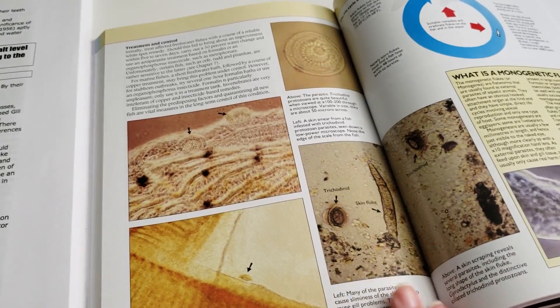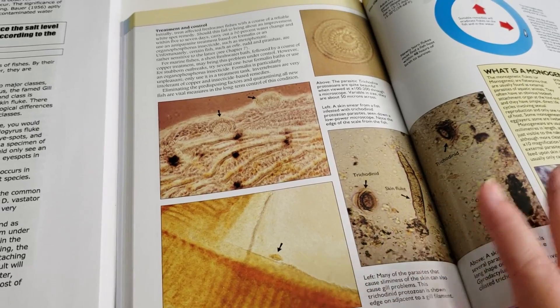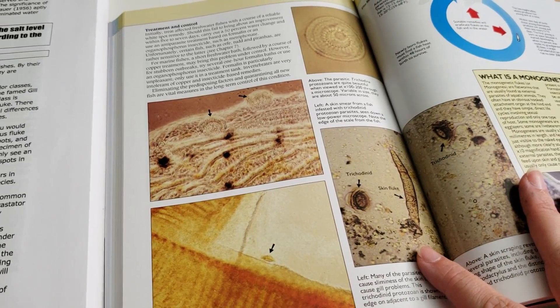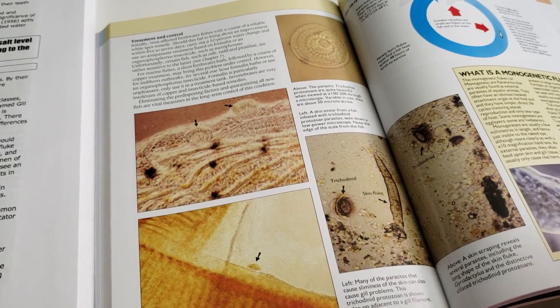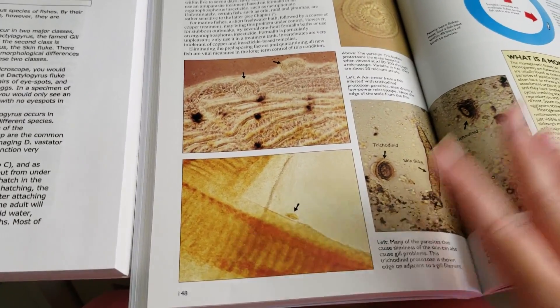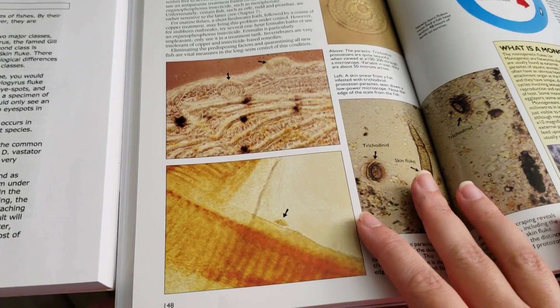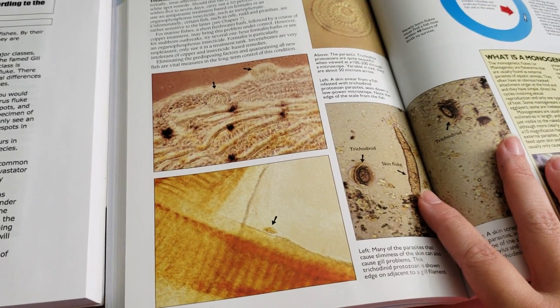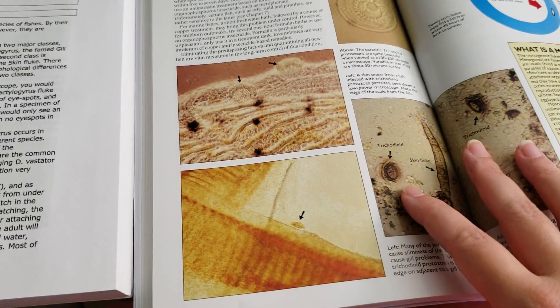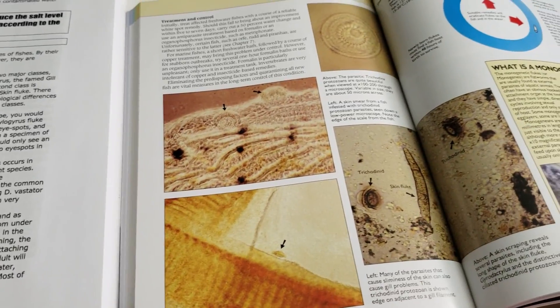But if you don't want to figure this out yourself, you can also use a microscope to either take photos or video for the fish vet that you are working with — any type of professional in the veterinary field that is experienced, preferably with freshwater fish, will be able to help you identify what is wrong with your fish when looking under a microscope, if that is something you're not familiar with.